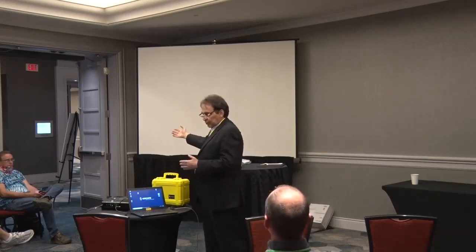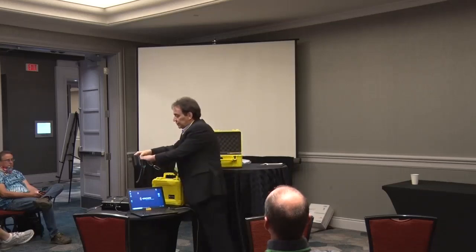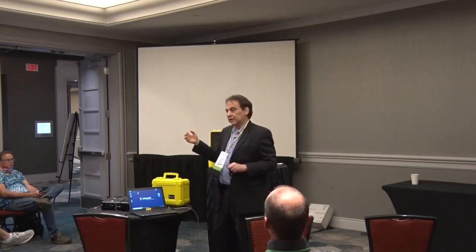I won't be able to get a good reading in this room right now, because the correction for the stuff that's stuck on the side of the wall here is all done in math. It works okay, but it's not perfect. You get better readings with a clean cell in low air, but the recovery is fast enough so you can go from hole to hole in your floor.